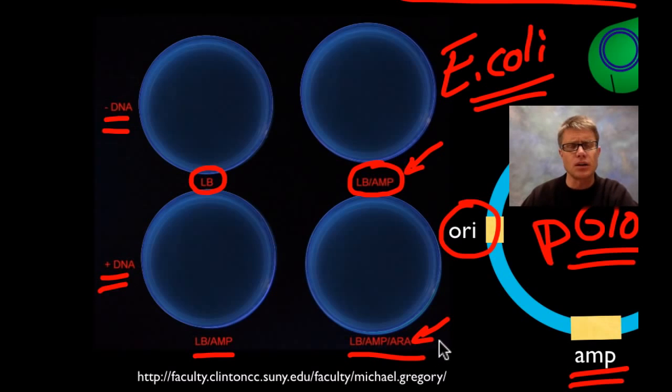And I'll show you what all those things are going to look like in just a second, but first let's discuss it. So basically what you get is a plasmid. A plasmid is a little bit of DNA. We're going to add it to bacteria. And so the protocol for doing that basically entails putting them on ice, the bacteria. You then add a transforming liquid. It's calcium chloride is what it is. And that causes them to kind of loosen up their membrane and more likely take in that plasmid. We're also going to heat shock them. So they'll be on ice, then we'll heat shock them, and then some of them will pick it up.